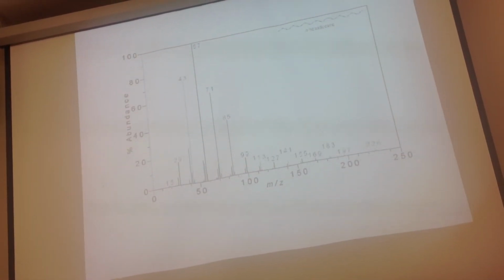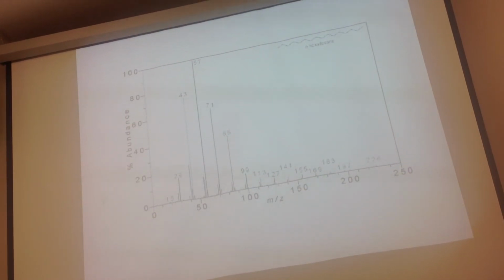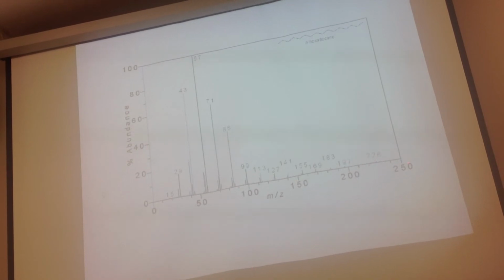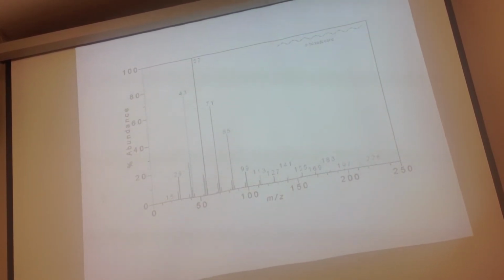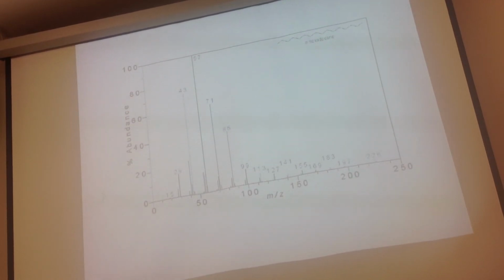Oh, as far as, I don't know. I don't have an answer for that. It must have been, for whatever reason, not much of it. I don't know why that minus CH3 didn't show up. Just didn't. Okay. Don't know. I don't know why a piece that would be 14 carbons is better than a piece that's 15.